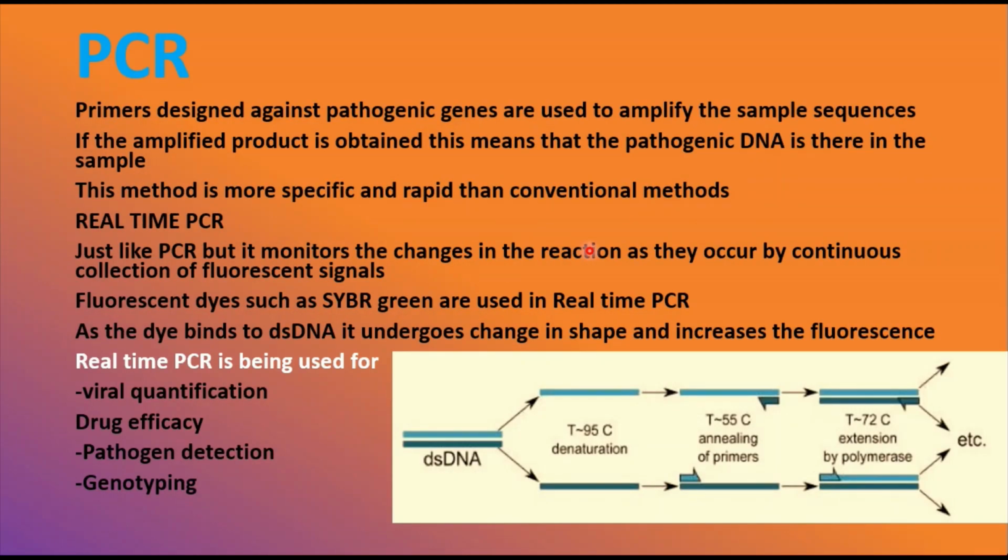Then moving to the PCR. Here the PCR is a special type of technique used for the in vitro enzymatic synthesis of specific DNA sequences by Taq and other thermoresistant DNA polymerases. The PCR technique uses oligonucleotide primers that are usually 20 to 30 nucleotides in length and whose sequence is homologous to the ends of the genomic DNA.